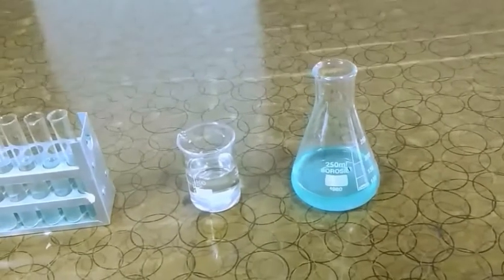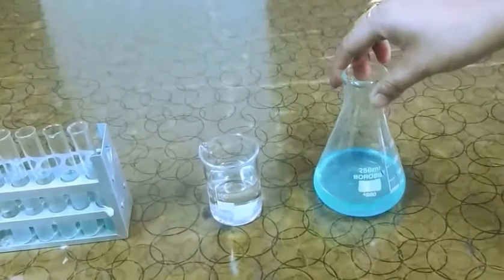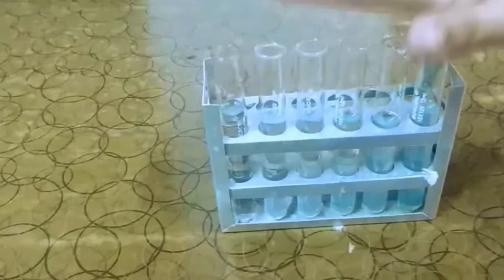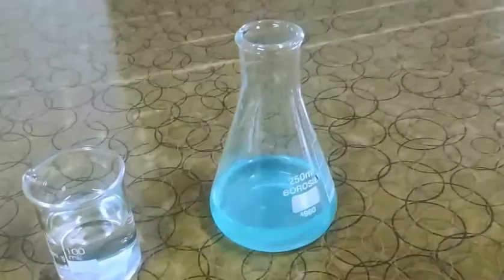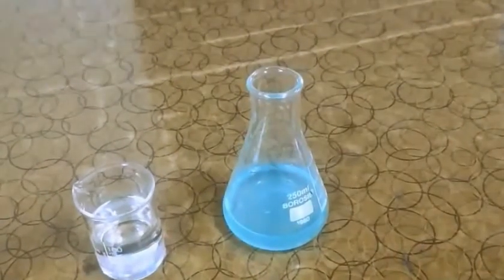Coming to the practical part, I have prepared copper sulfate solution stock, and then I have taken distilled water in this beaker, and these are the test tubes. The solutions are already prepared. I'll be explaining this. For this stock solution of copper sulfate, I have taken 1 gram of copper sulfate in 100 ml of distilled water. Like that I have prepared.